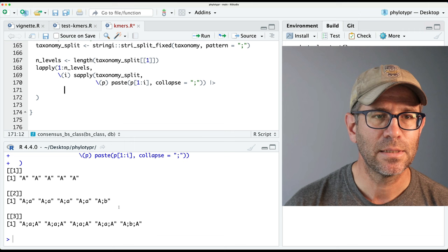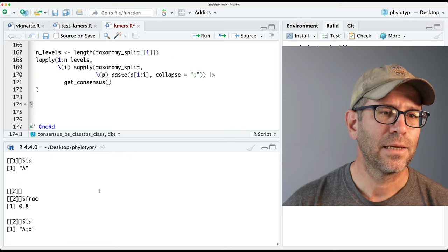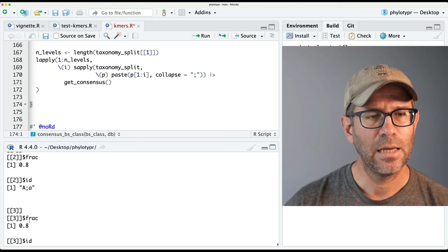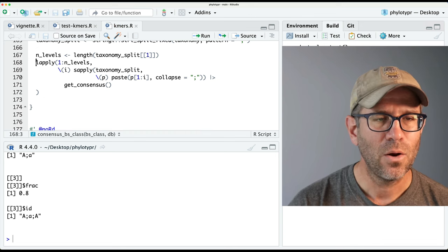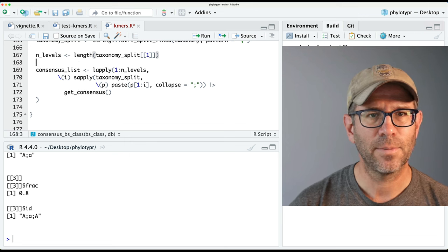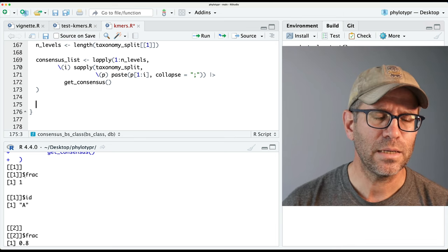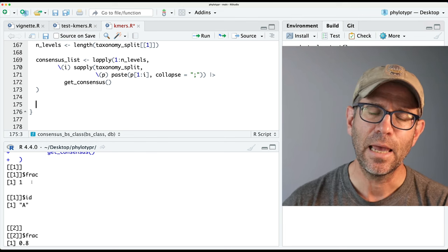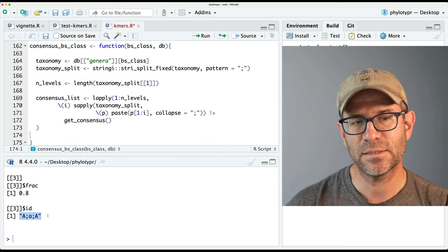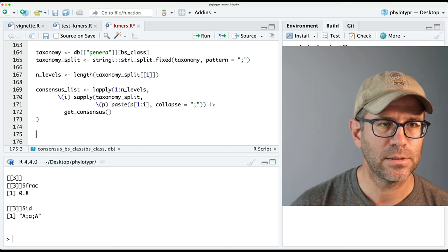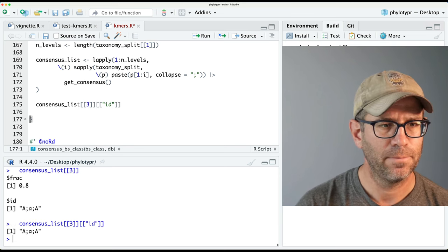Then we want to pipe this into our get_consensus. So we'll do get_consensus on that — and that gives us our consensus. We get our fraction and our id, and we get 0.8, 0.8. Wonderful. So here we'll call this consensus_list. What we want is this transposed: one element of the list being the fraction and one being the id. We'll have two elements with vectors three units long. To get the taxonomy, I'm going to use the third slot because that's the full string. We can do consensus_list[[3]] and that gets us that, then id, then split it apart with stri_split_fixed with pattern equals semicolon, and unlist on that — so that's our taxonomy vector.